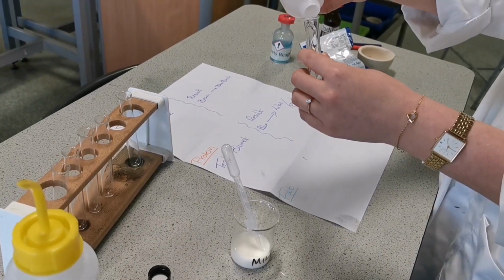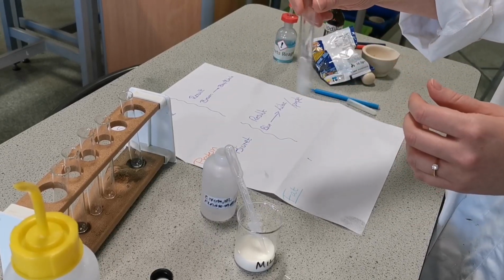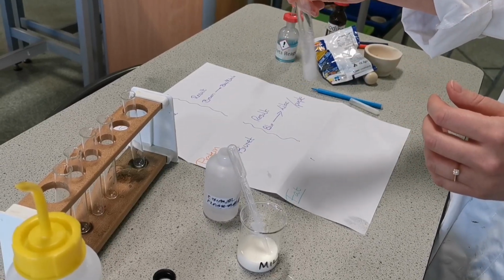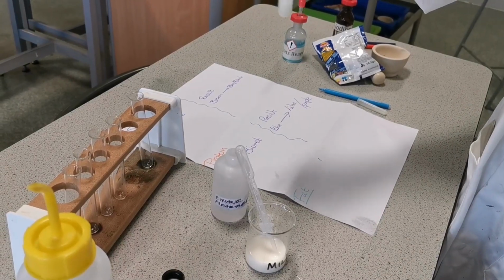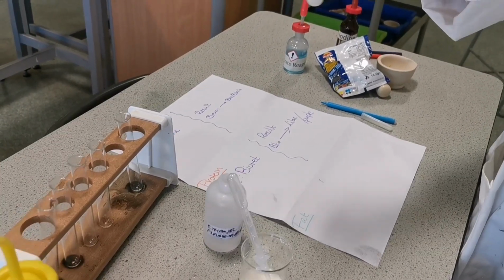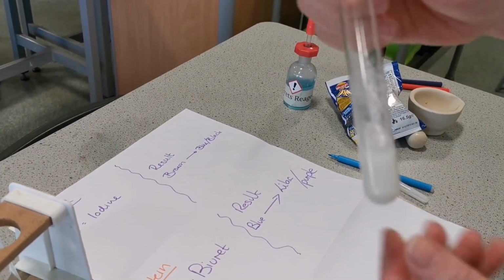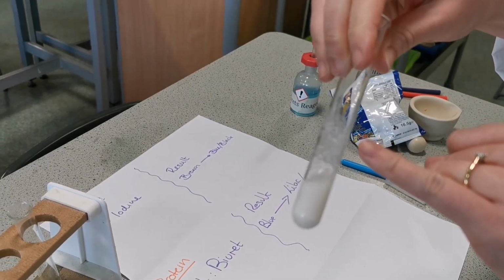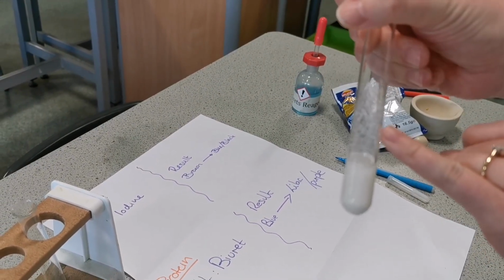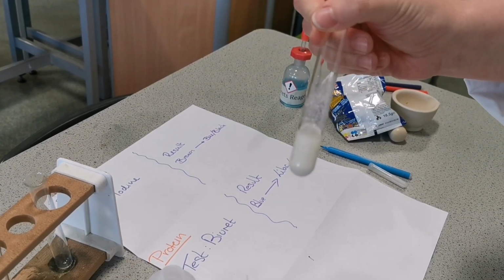What does flammable mean, miss? It means it's very easily going to catch fire. It's going to be a bad fire, so watch out for that. You're going to put the ethanol in with your food substance to be tested and give it a good shake. Now, the positive result for the fat test is that you get what is called an emulsion. That means you get this cloudy substance, and you can see that that's stuck all around the edge of the test tube there.